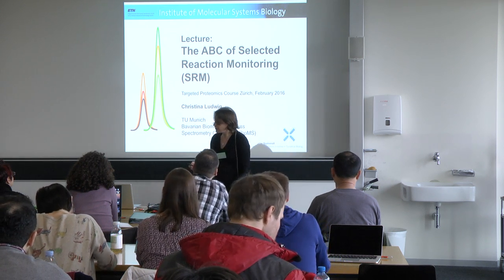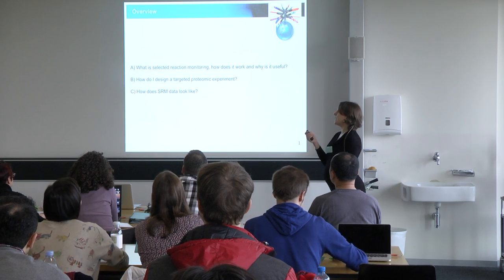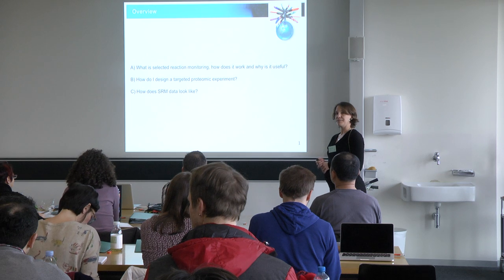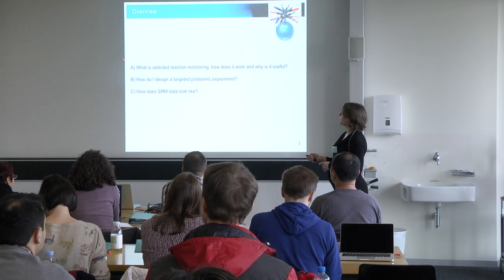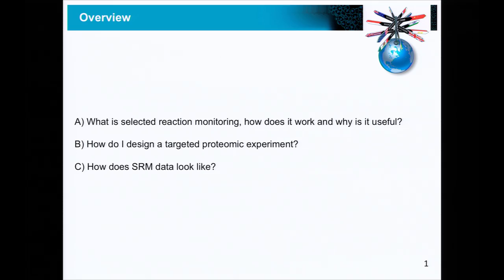I have structured my presentation into three main parts, and each part is headlined by a fundamental question regarding SRM. In the first part, we will discuss what SRM actually is, how it works, and why it's useful. Then in the second part, we will design a first targeted proteomic experiment together and see what's important to consider. And in the last part, we will look at some real data so that you get an idea of how the data looks.